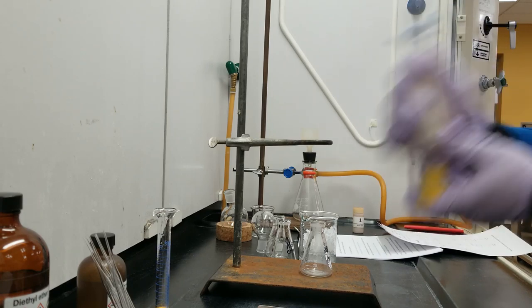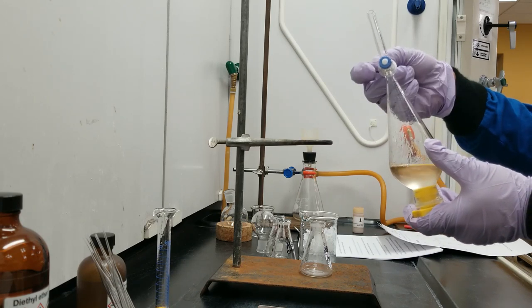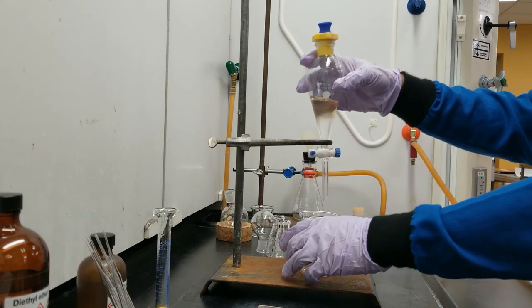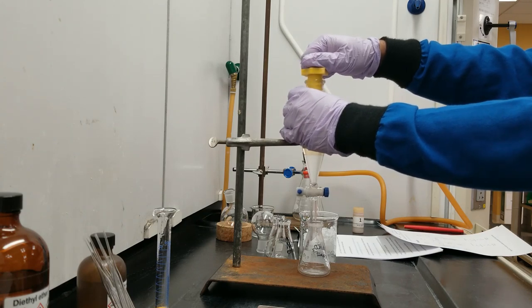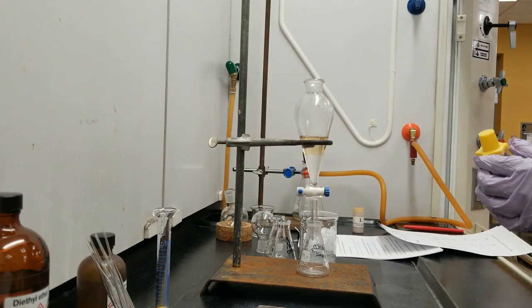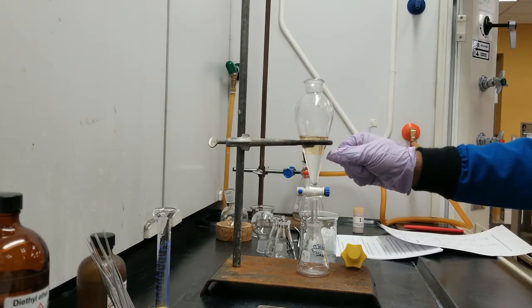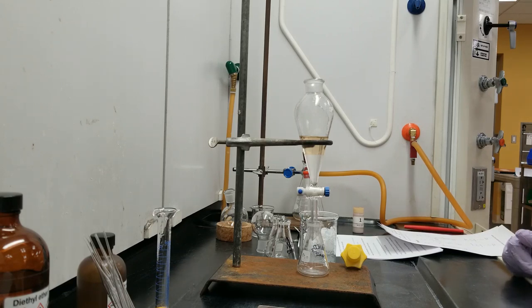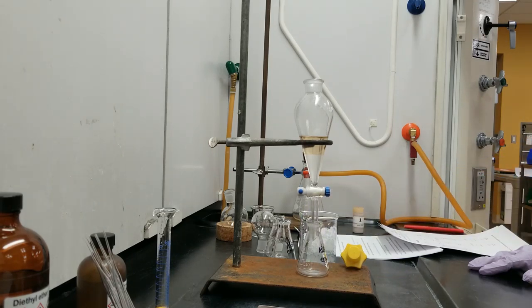I'll probably vent this for 20 seconds and then keep it for about 1 minute so that the layers get separated again. And while setting it on the ring, we need to take off the lid so that there is no buildup of pressure inside the separatory funnel. Okay, the water layer is getting cloudy. That means the acidic component of our solid mixture is getting transferred to the water layer, or the sodium bicarbonate layer.